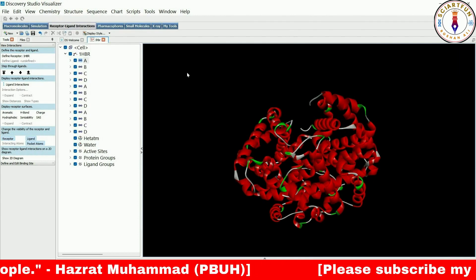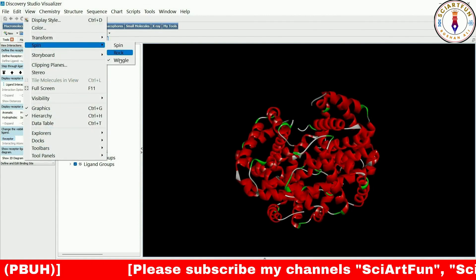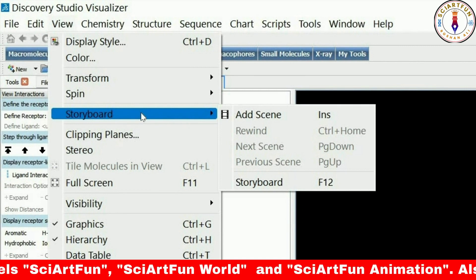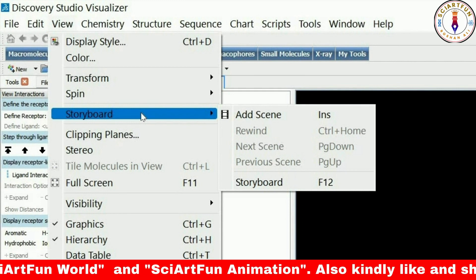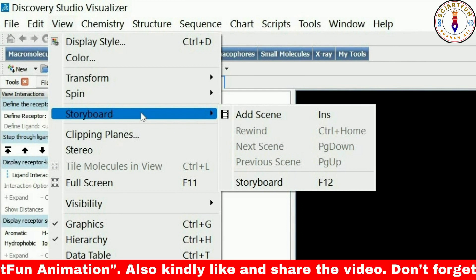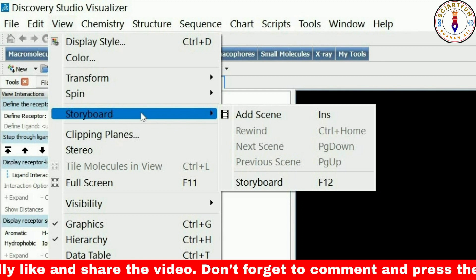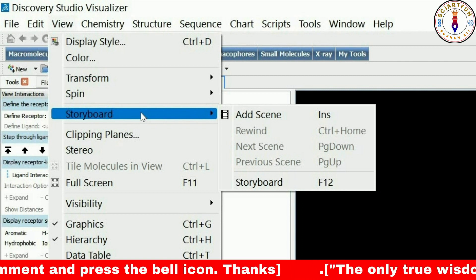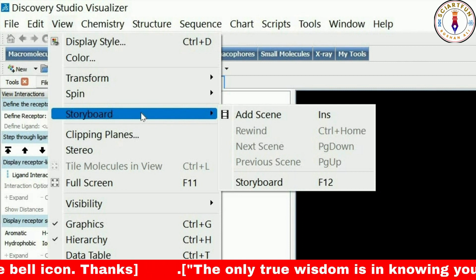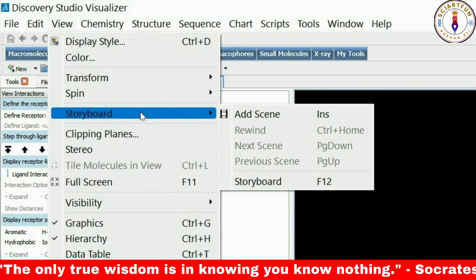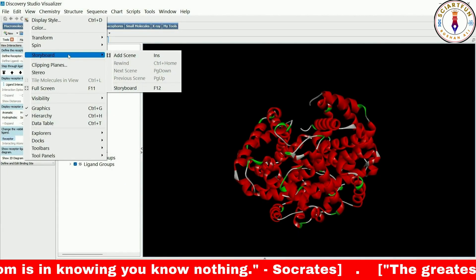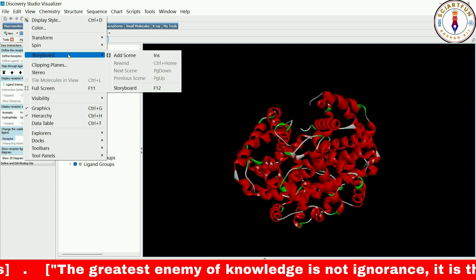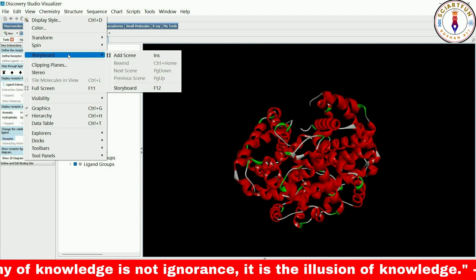Let's move on to the Storyboard. The Storyboard option in the View menu is a tool that allows you to create a series of snapshots or frames of the protein model. These frames can be used to create an animation of the protein model over time, which can be useful for presentations, educational materials, or scientific publications. It allows you to create a visual representation of changes in the protein's conformation, movement, or other properties — for example, showing the protein moving from one conformation to another, or demonstrating the binding of a ligand to the protein.